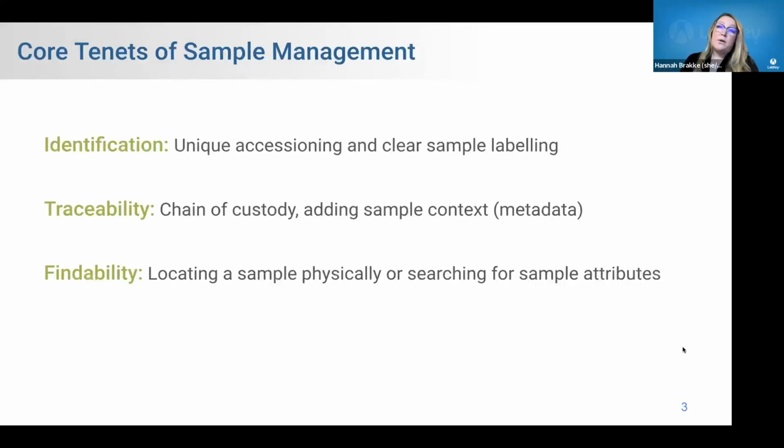So as we're thinking about streamlining sample management, coming back to those core tenets of sample management, I put this into ChatGPT. I was very curious what the internet would say. They had 11 or 12 different answers for this, but I think it really boils down to these three things. These stem from the FAIR principles as well, if you're familiar with those. These are the three things that we see folks wanting to do with sample management and struggling to do, especially within spreadsheets.